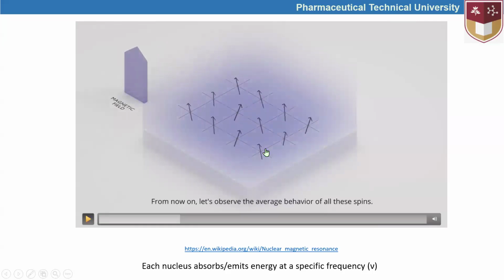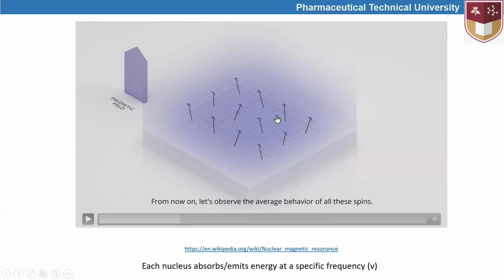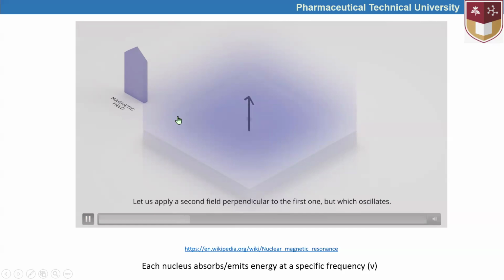We said that the nuclei with a lower magnetic energy are aligned with the magnetic field. Here, those that have lower energy are indicated, just to understand. The ones that have higher energy have the spin against the magnetic field. So this is the point that we have to understand how the magnetic field becomes, let's say, constant by the external magnetic field.